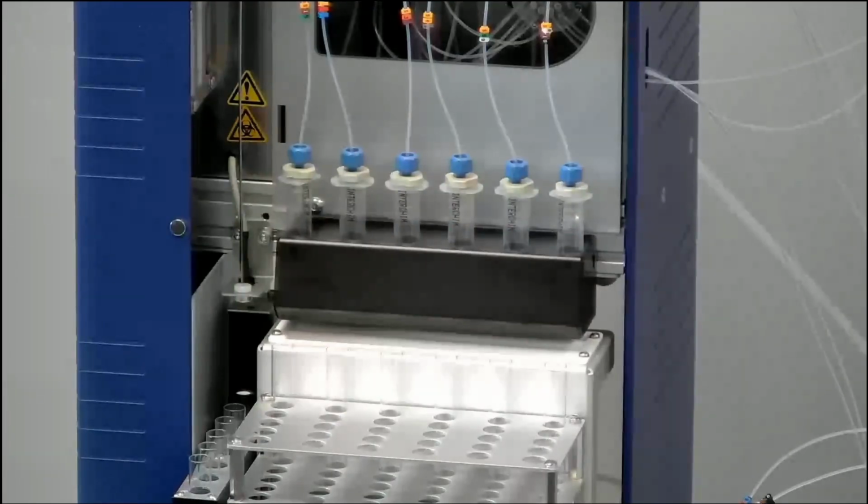With this type of instrument, the main problem is that it's manual. So you have to stay in front of your system and inject manually. So it's not really secure for the user because you are in front of your solvents, you have no security.